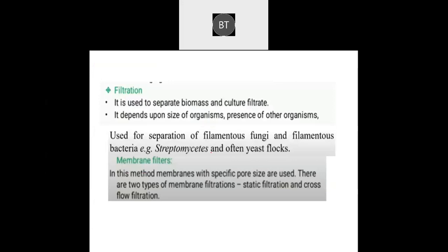So, consider this is a membrane filter. Obviously you know that filters will be having pores, and this pore size will vary. It can be of different sizes. However, clogging of filters is the major limitation.